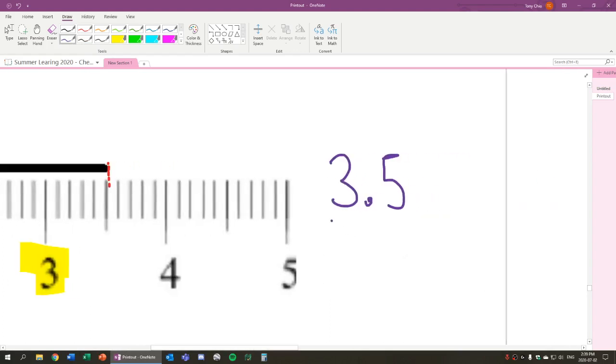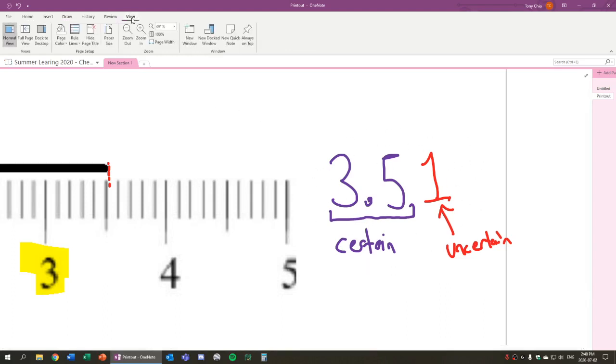Now that is what we're certain. These two right here are certain. We could actually estimate one more value after that, and that number is uncertain. So what can the number be? Well, looking at that, that number could be a 1. And this value is uncertain. Now, what this means is that we can actually trust all three of these numbers. Even though this is uncertain, it still is. Remember, what is significant figure? Significant figure is how much can we trust it based on accuracy and precision. We increase the number of precision here. We decrease the accuracy though. But it's a balance of both. So this is an acceptable value.